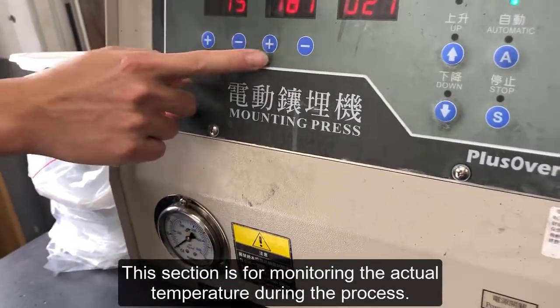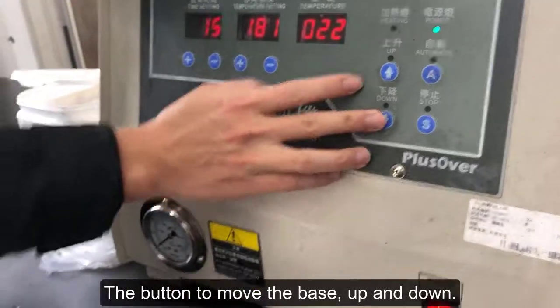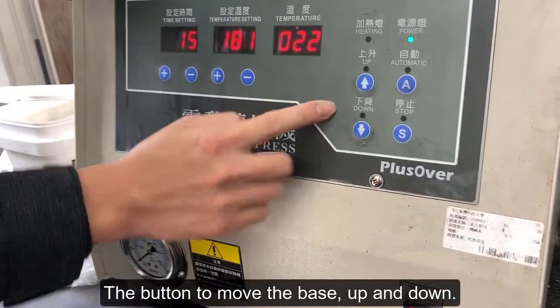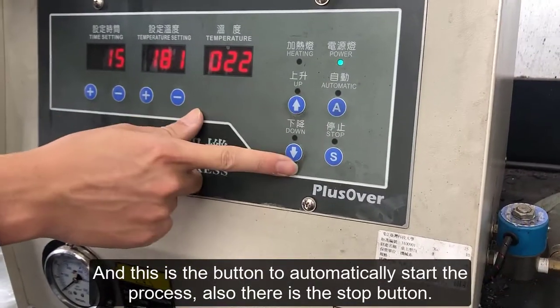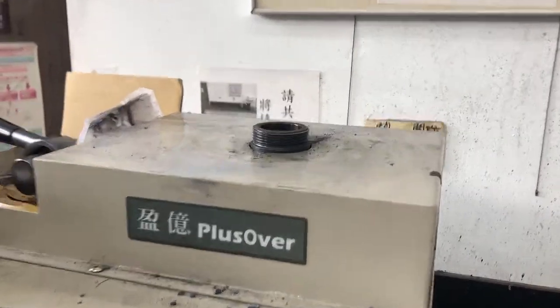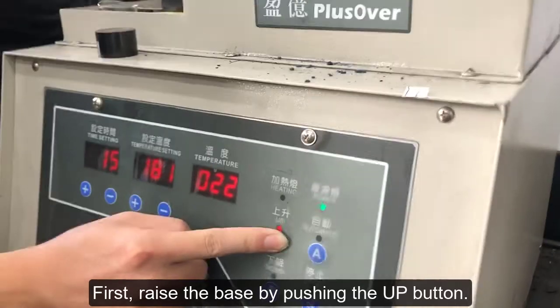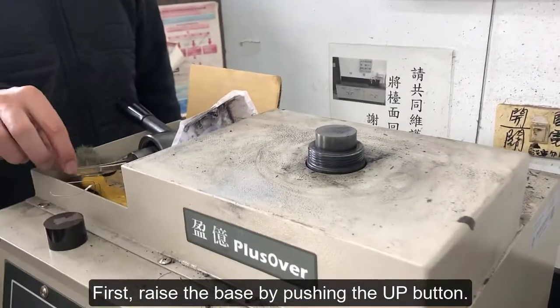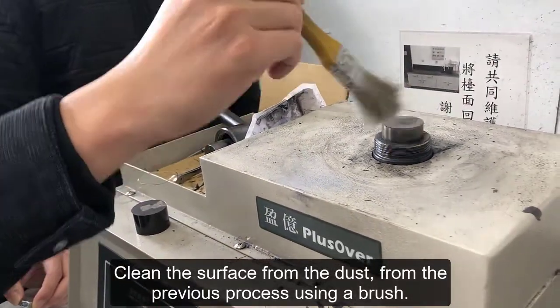This section is for monitoring the actual temperature during the process. This button moves the base up and down, and this is a button to automatically start the process. There is also a stop button. First, raise the base by pushing the up button.